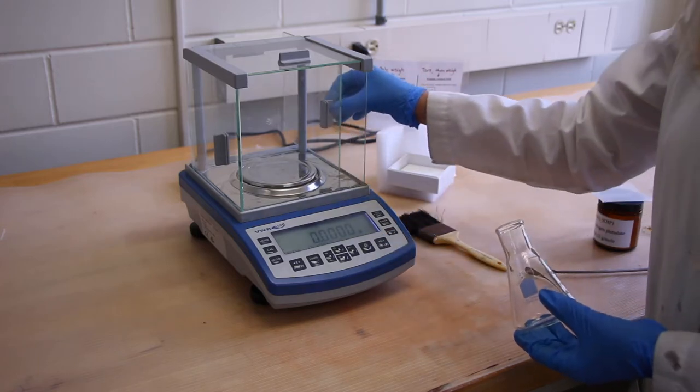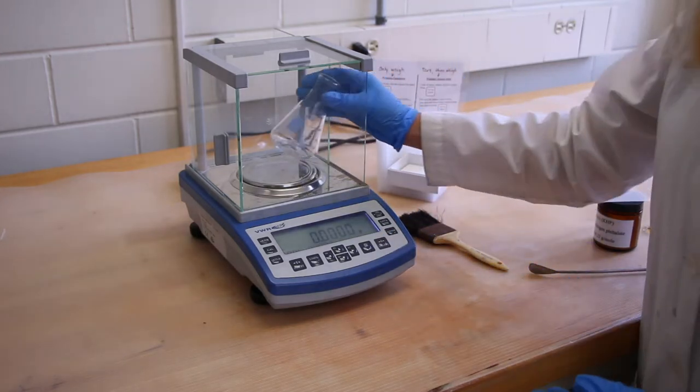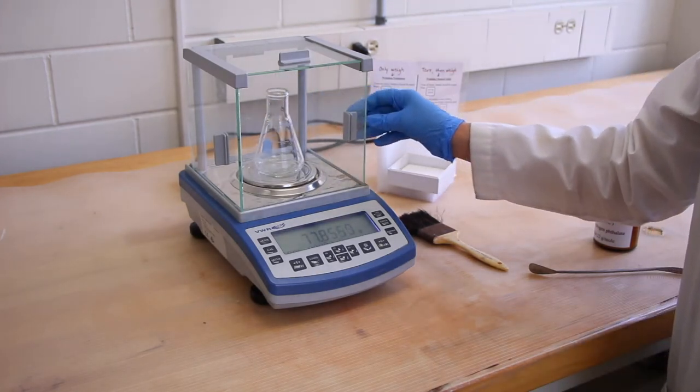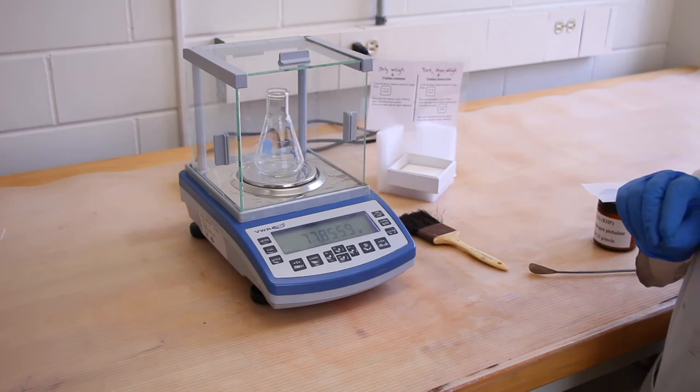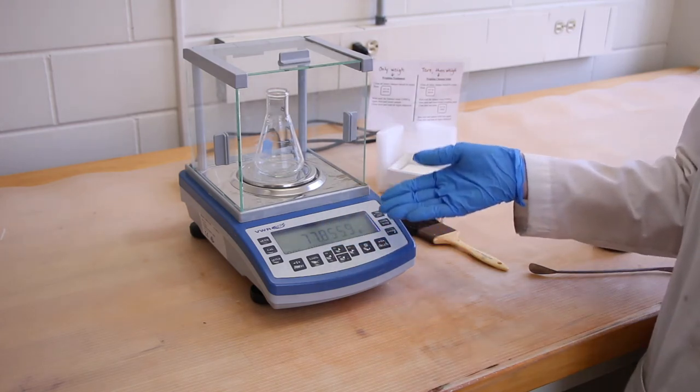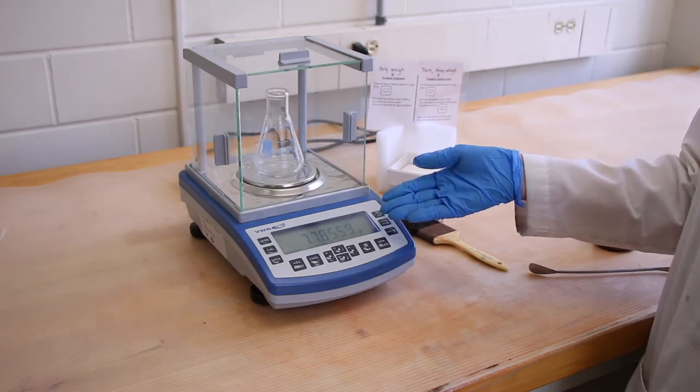Then we'll open up one of the doors, place our piece of equipment on the scale, and close the doors. And then we will read and record all the digits displayed on the balance.